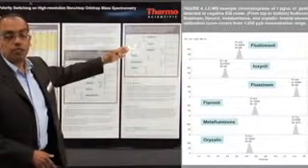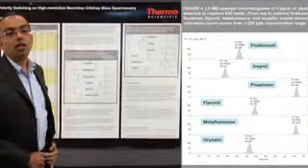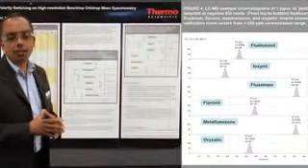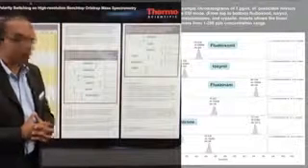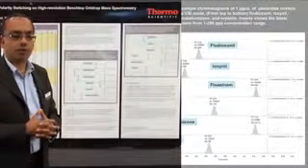Similarly, this figure here shows a selection of pesticides in negative electrospray mode. Again, the limit of detection is 1 ppb, and the dynamic range is between 1 to 250 ppb. And on the right hand side here, we have the linearities for each of these compounds as well.